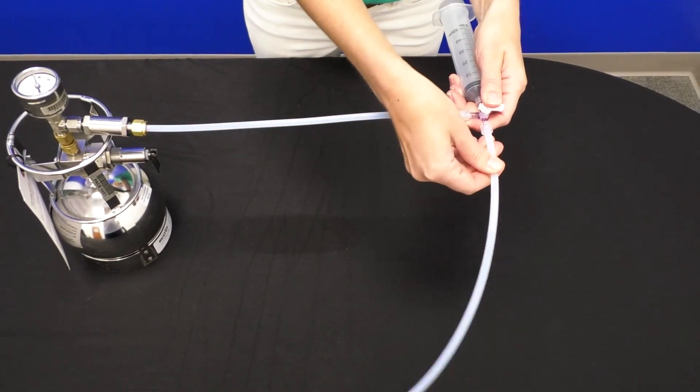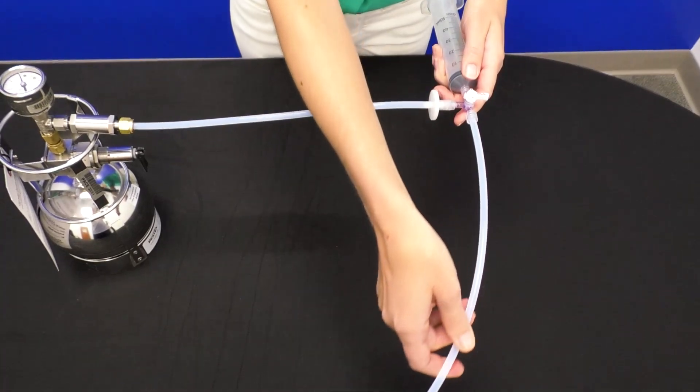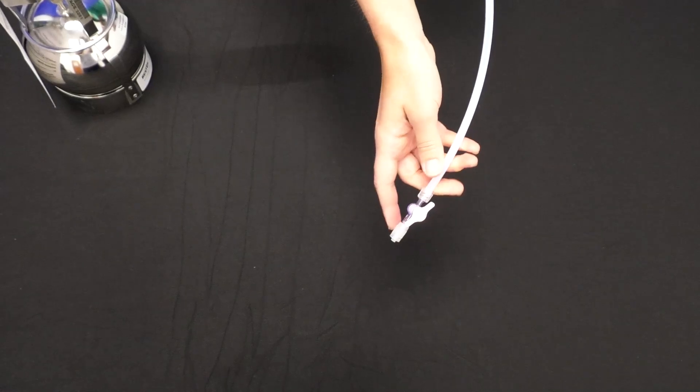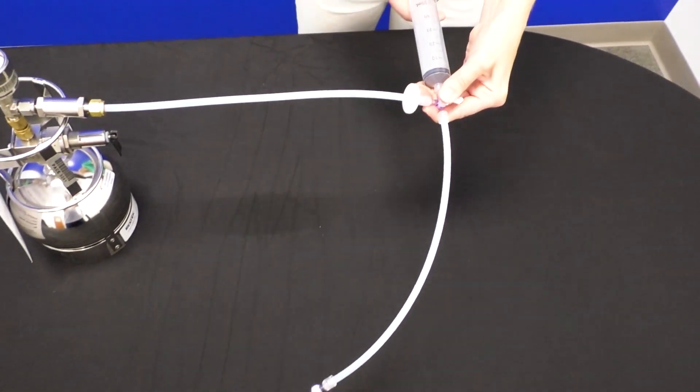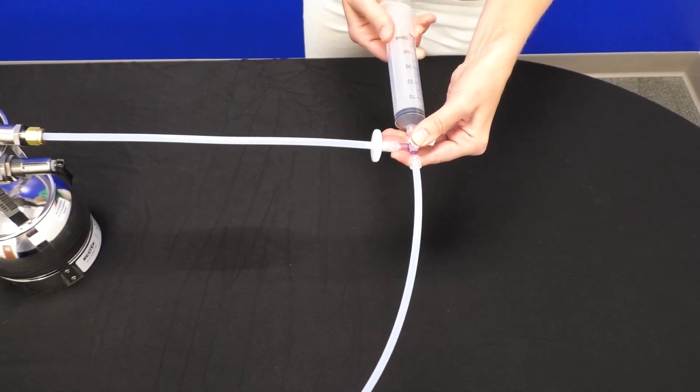Then you'll attach the tube, screw the tubing into the bottom of the four-way valve. And then the other end, you have your two-way valve and then the other male slip adapter. At the top here is where you connect your syringe. You can see that it's just screwed in to the top.